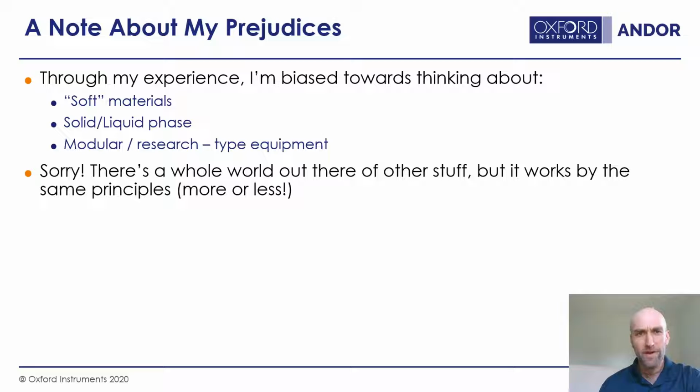Further, I just wanted to point out I'm presenting a lot of this stuff through my own prejudiced viewpoint. I'm seeing these things through my experience, and I'm biased more towards soft materials, so organics, I guess anything that's not a hard crystalline material maybe. I'm usually looking somewhere in the condensed phase, so there's a whole world of gas phase Raman that is potentially very interesting. And I'm personally biased towards using modular or research type equipment, so not a ready-made Raman microscope system.